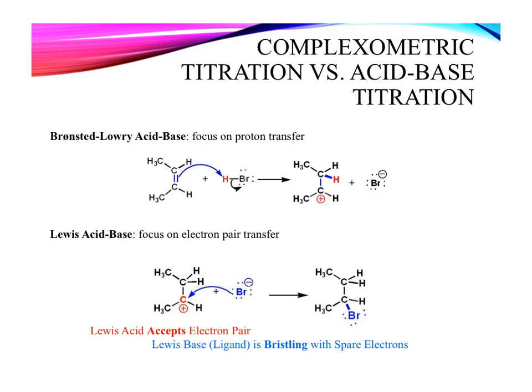We're familiar with acid-base titrations from general chemistry. There, we mostly dealt with Bronsted-Lowry acid-base definitions, where an acid was a proton donor and a base was a proton acceptor. Here, we're introduced to a new type of acid-base chemistry that follows the flow of electrons instead of the flow of protons. In Lewis acid-base theory, the Lewis acid has room to accept electrons, while the base is bristling with spare electrons to share.